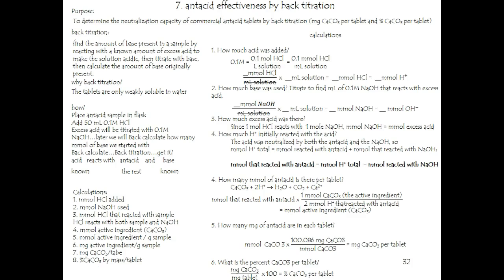Today's lab is relatively short. I've got the lab manual in front of me here, and I see that it's actually starting on page 62. It's only 8 steps, so this might not take too long. And these calculations are easy to mess up, so you can stick around and I can give you a little bit of assistance with them if you need it, or you can take off and perform them at home. So I see 8 steps, and it sounds pretty straightforward.